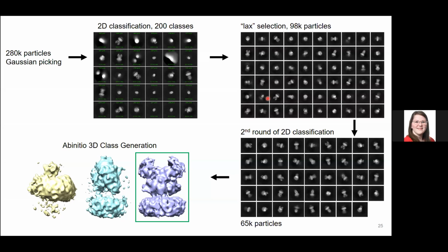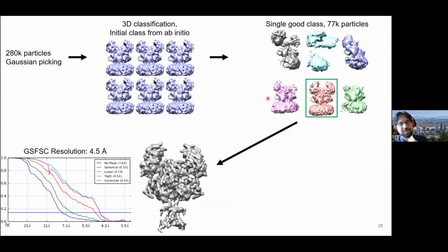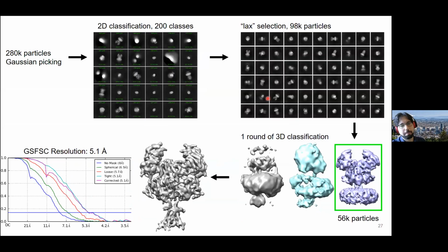The next question we had was, what does the shape of the FSC mean for the quality of the new higher resolution particle? When the FSC improves, that means that you have a higher correlation at that value of resolution.